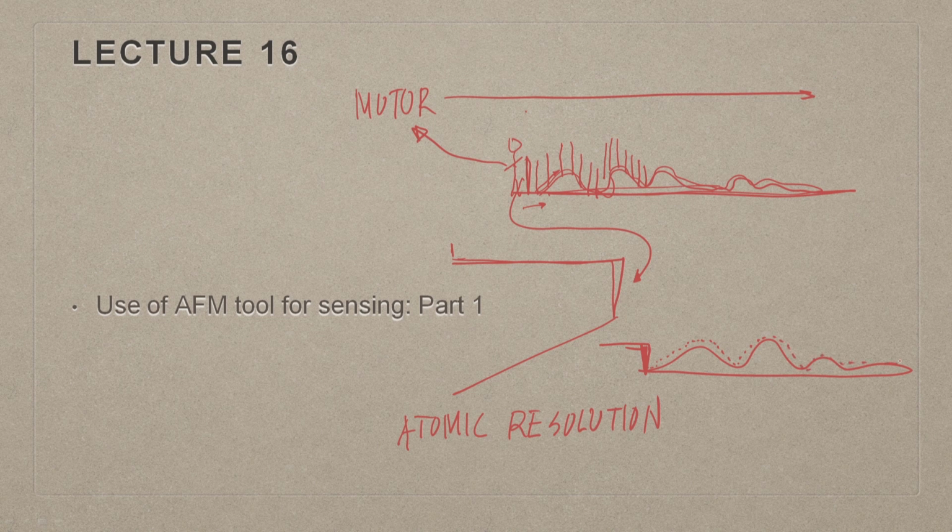Eventually, it will give you a profile. It will say, okay, here you have the height is like this, here you have lower height, here you have higher height, again lower height. There is a height, but this is not as high as the previous one. If I call this T1 point, this is T2 point, then there is a T3 point, then there is a T4 point. So, you can say that T1 is slightly smaller than T2, while T2 is greater than T3. T3 is greater than T4, which is the fourth one, likewise.